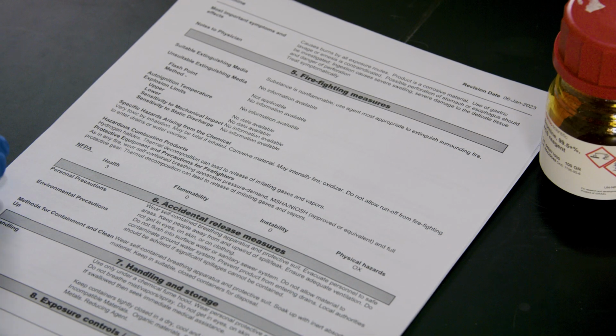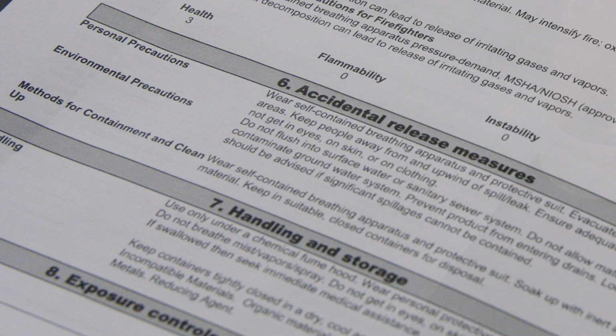Section 7, Handling and Storage. This section gives you information on how to safely handle and store the chemical. It helps you to avoid any mishandling or improper storage.